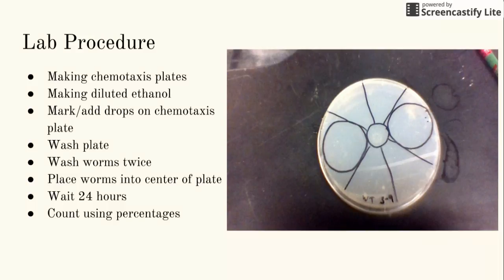On the day of the lab procedure, we took the chemiotaxis plate and divided it into six regions using two large circles and one small one, the small one being the drop site where we would put the C. elegans. We marked the ethanol using two little dots to distinguish which one had ethanol and which one didn't.